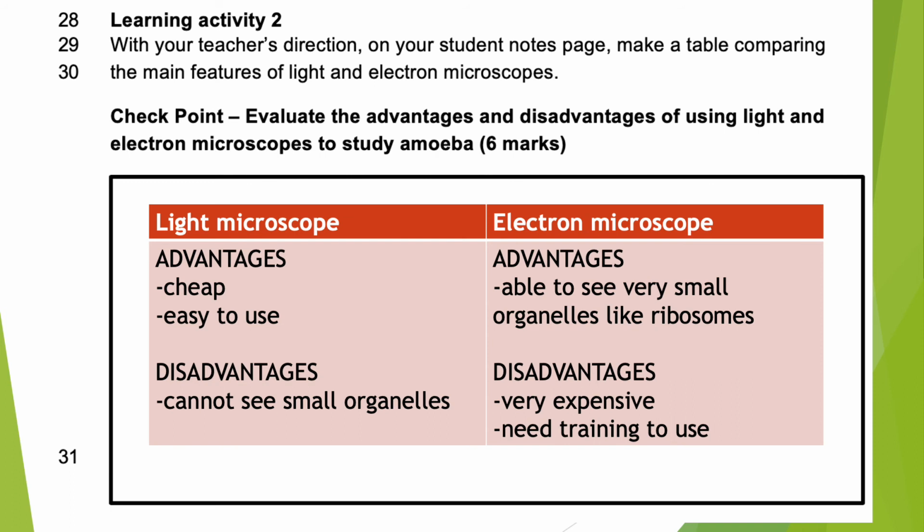With the electron microscope, I'll start off with the disadvantages because we've already kind of mentioned them. So electron microscopes are very expensive. If you just Google electron microscope price, you'll be able to see what I mean by that.